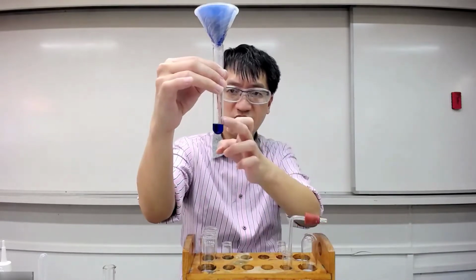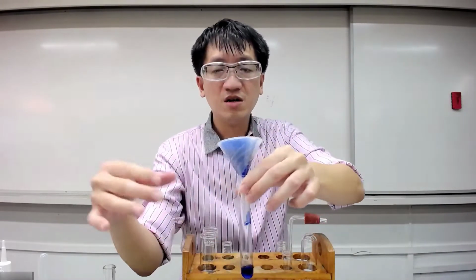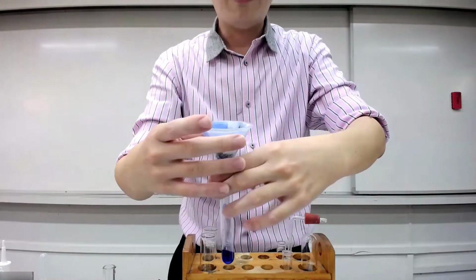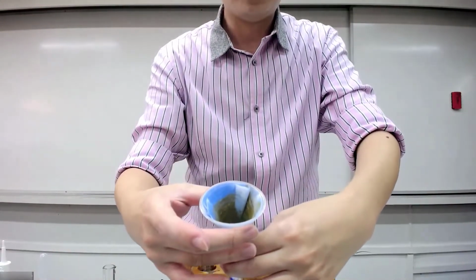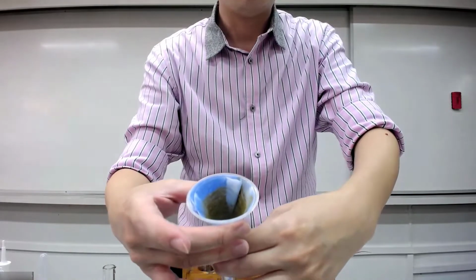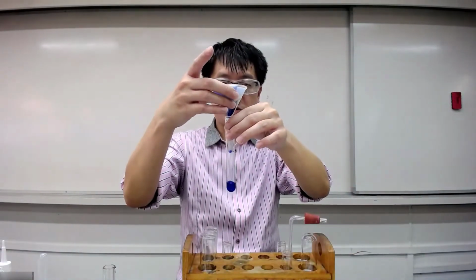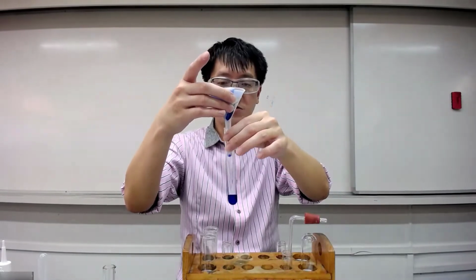Okay, so I think I should have enough already. I'm not sure. Okay, so I'm going to tilt it. I'm going to really try to tilt it without fearing. Can you see that it's really reddish brown over here? Okay. So I'm going to just shift this over.